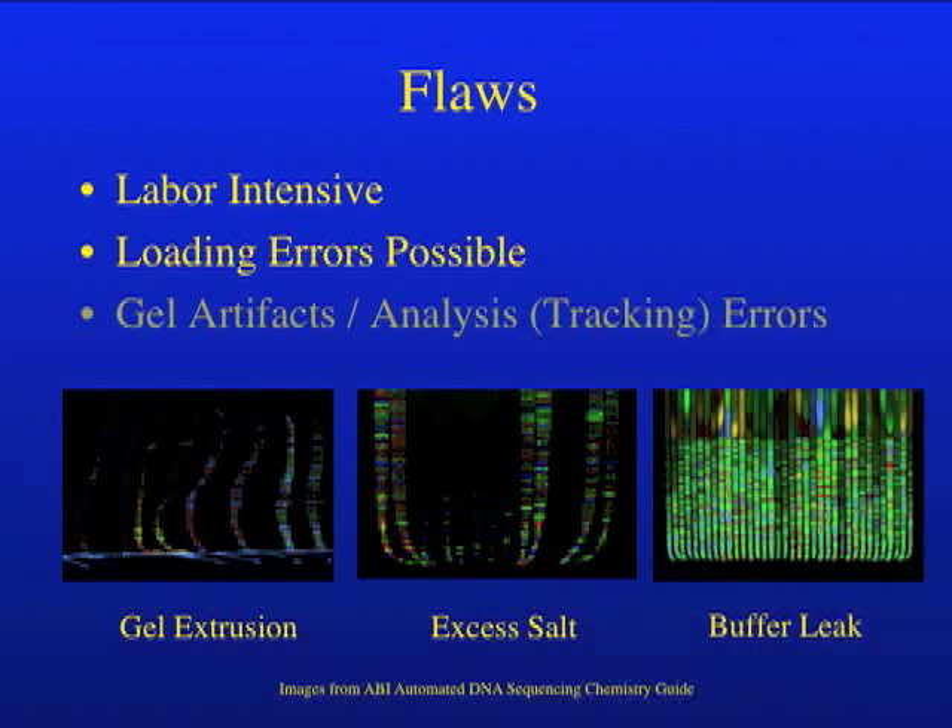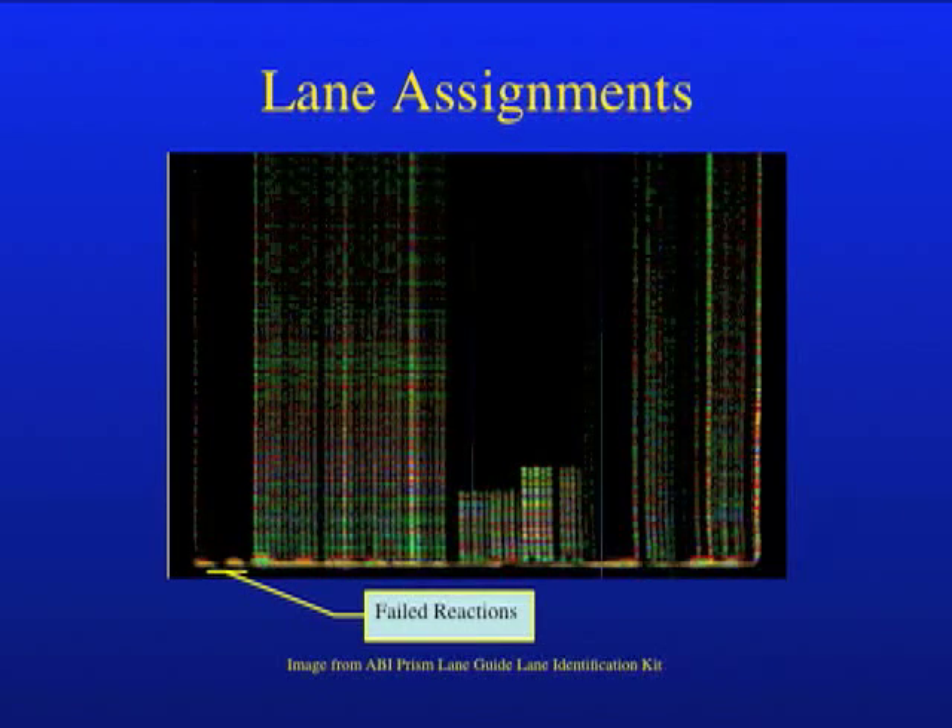Finally, the software that identified lanes and assigned them to specific samples could be confused if there were gel artifacts, including gel extrusion, excess salt in the samples, or buffer leakage. The lane tracking software could also be confused by a section of failed reactions with no signal, followed by an area of samples with strong signals, as we see here. If the software assigns the first sample with strong signal to, for example, lane 7 instead of 8, it would mean that every sample after that point is misidentified.